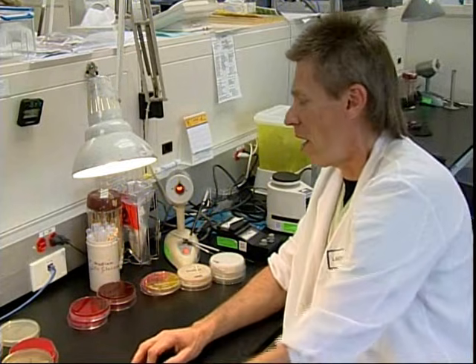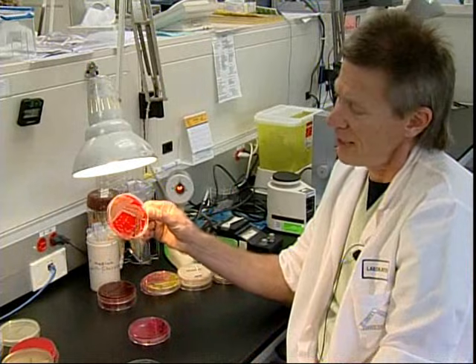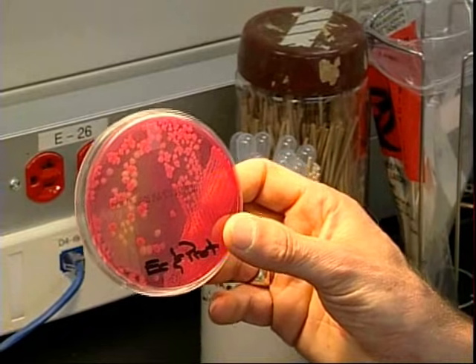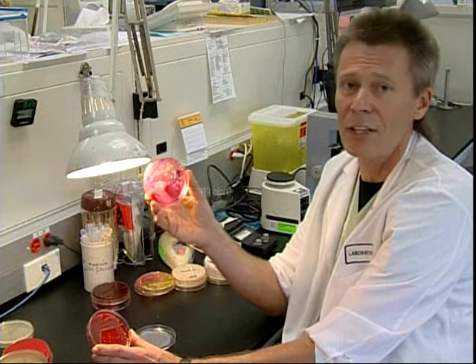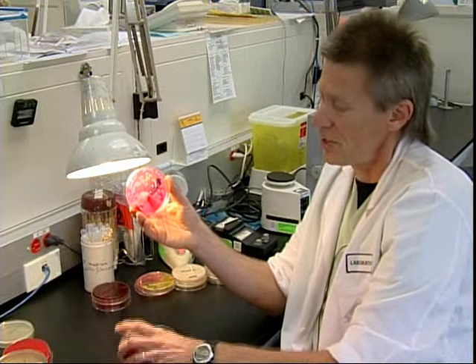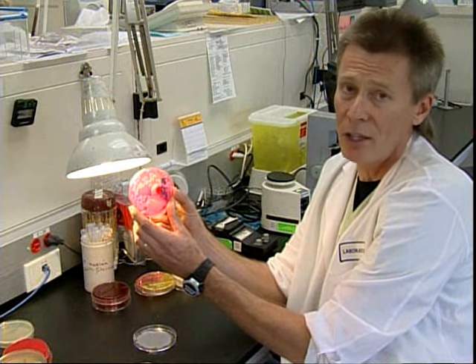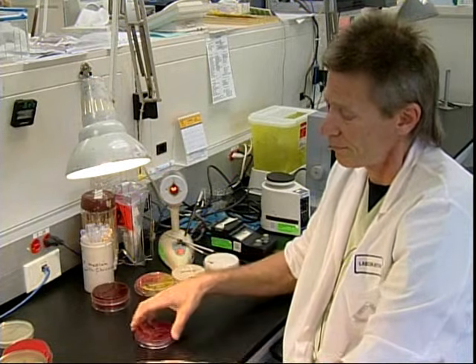Some plates are differential. If you look at this plate, you can't see much difference between the colonies. But because we use the MacConkey plate, the difference is a lot clearer. The MacConkey plate is a differential plate. It utilizes lactose to differentiate one bacteria from another. Here you see the pink colonies that are lactose fermenters, as opposed to the non-pink colonies that are non-lactose fermenters. This is a good help in identifying bacteria.